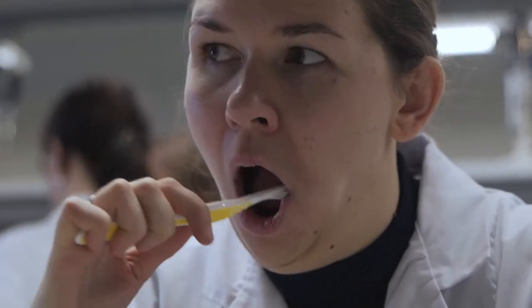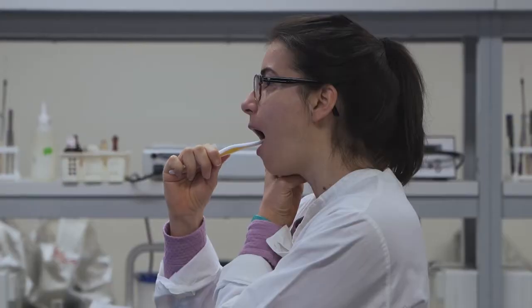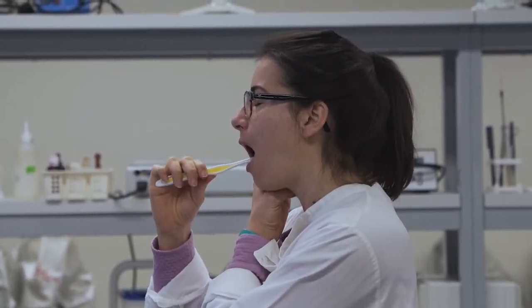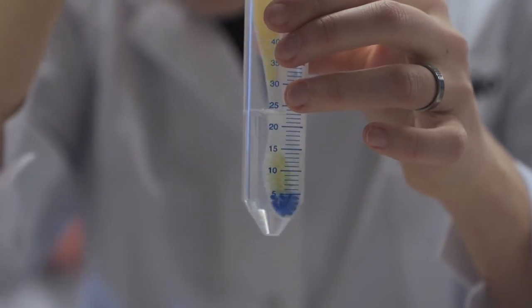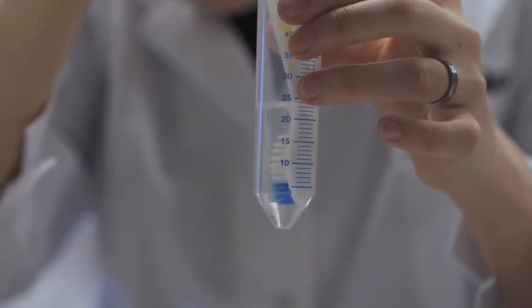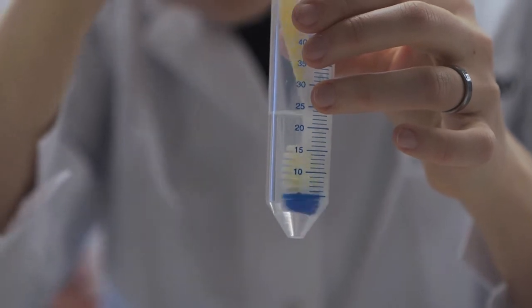Now take the other toothbrush and again make at least 10 circles on the same surface on the right and then on the left cheek. Put that second toothbrush with its head inside a 50 milliliter tube with 15 or 20 milliliters buccal cell buffer.